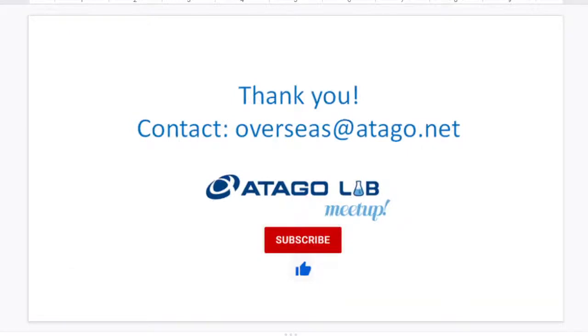I think it's easier to watch the video to understand more deeply the differences between RxI and Rxα, so I will move on to the video now.